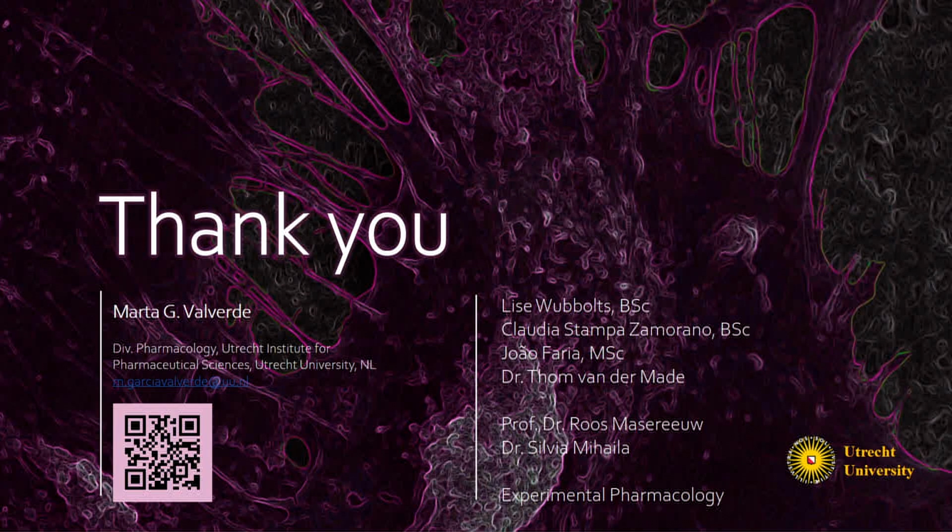I fully agree with that statement. Yeah, the fiber is quite large compared to the diameter of the glomerular capillaries, which are very, very tiny. This fiber, because it's commercial, we cannot tune it. So that's a limitation. We are trying other approaches to be able to get smaller diameter tubes, but not based on this one. This one is more useful for drug injury, toxicology studies, etc., because we have a higher throughput than whether we use any other chip or any other biofabrication strategies to create that tube. We are willing to forfeit that for a higher throughput here.